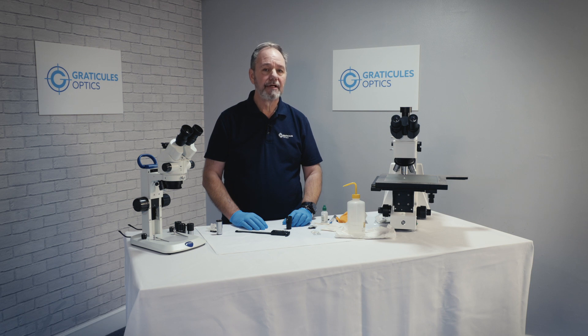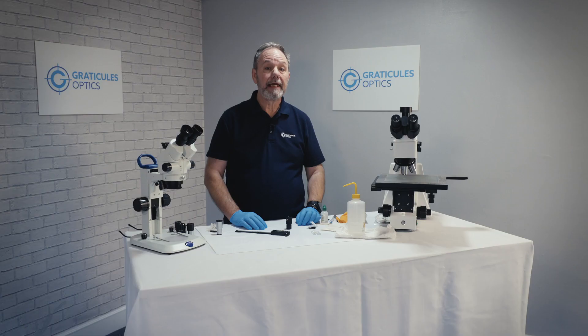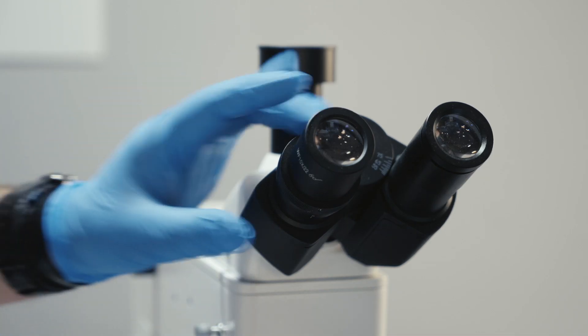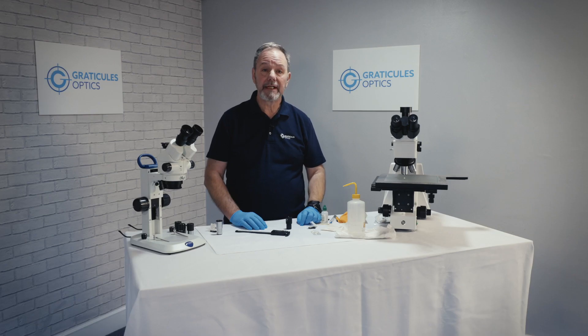There are many microscope brands, most of which can be fitted with an eyepiece reticule, and there are also many different types of eyepiece which can fit into the tube. Generally there are two sizes of eyepiece: the larger 30 millimeter, such as on this microscope, or the smaller 23 millimeter found on many other compound microscopes. It's important to make sure you select the right size reticule for your eyepiece.